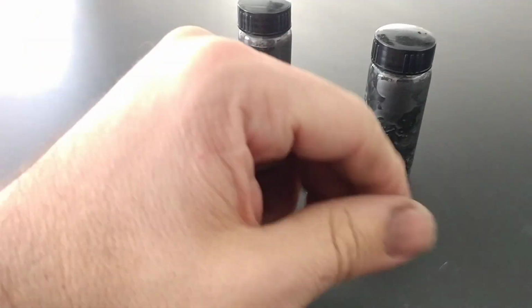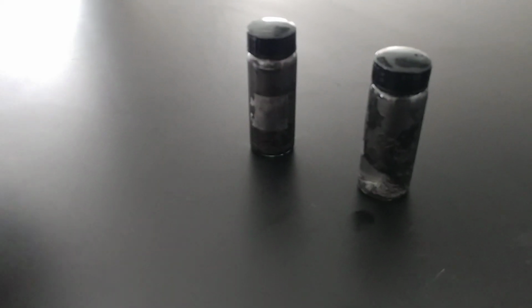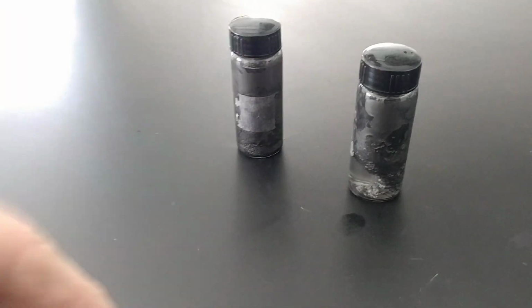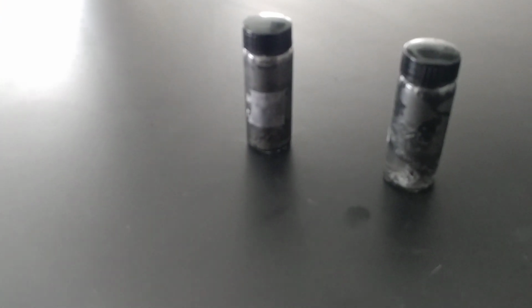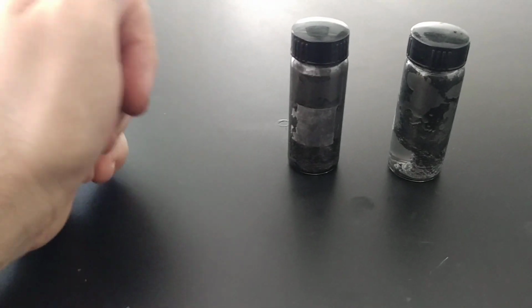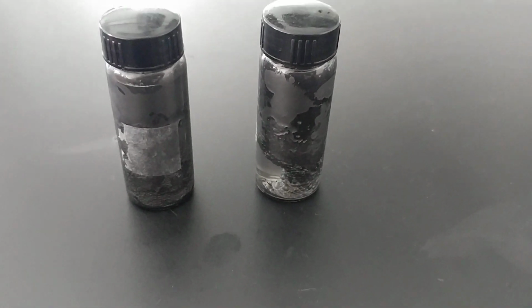I mean, yeah, it might not be graphene. It might be in the 20 to 50 layer thickness, and anything under 10 is actually considered graphene by standards. But at least you got something really thin and something to fool with, and you might start approaching some results that you're looking for. And like I said, this is remarkably the simplest test that I've seen that definitively will give you some kind of result.